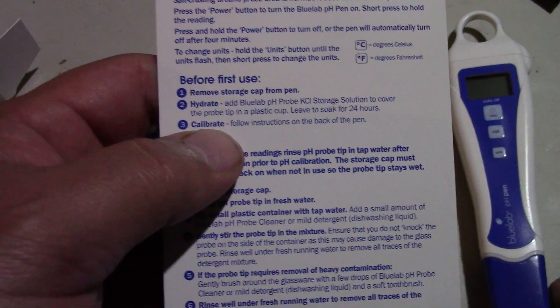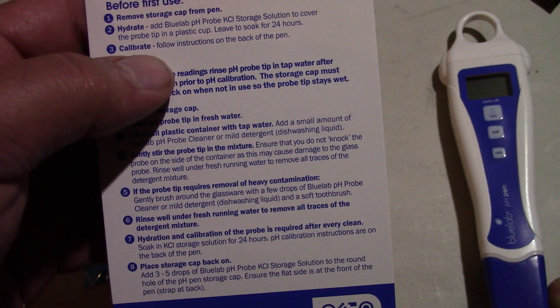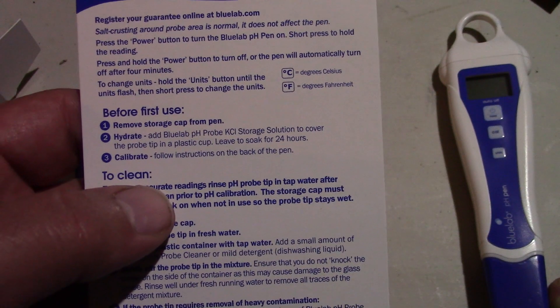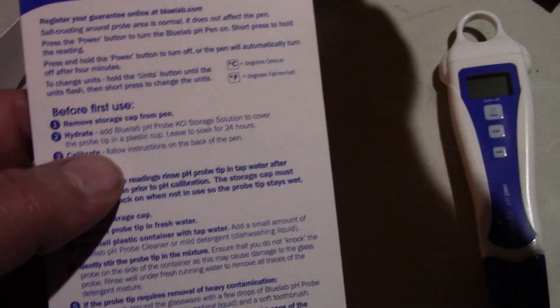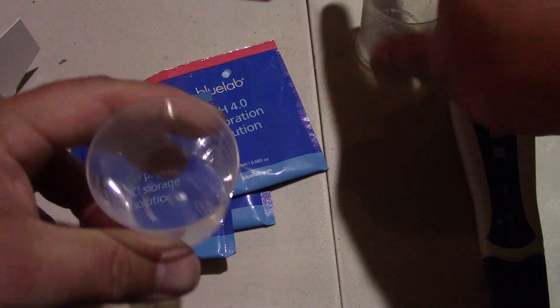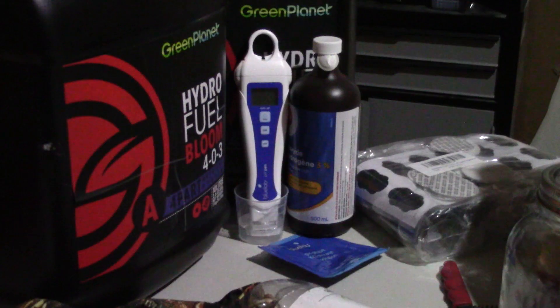Before first use of the pen: hydrate the pH probe by covering the probe tip in a plastic cup, leave to soak for 24 hours, then follow instructions on the back of the pen to calibrate. So I'm going to use a plastic cup - I have some right here. I've propped it up against the back side and another side just so that it doesn't fall over. I don't want it to fall - it's got to be in there for 24 hours.